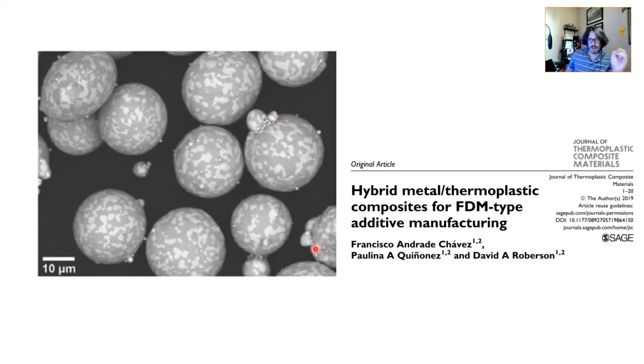On the other hand, we have backscatter electron imaging. I'm sorry, it's a little pixelated. I have the original somewhere, probably on a hard drive that I've used to back this stuff up. Here's an article myself and my group put out very recently, just last year.